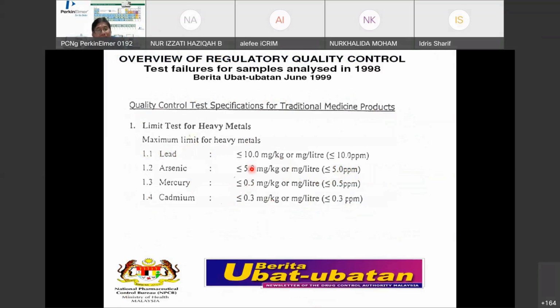Well, fine. But you contain mercury. If using normal acid dilution, mercury is lost in the sample prep, so you won't detect it. It's not because it's not there. It's lost during sample prep.